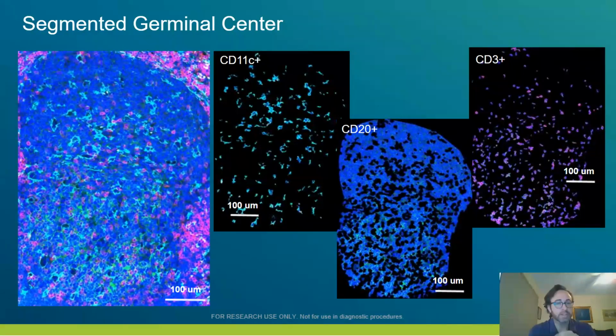The first of these is myeloid cells that are actively presenting antigens and helping T cells understand what they have observed out within the wide world of the body. We're marking these cells with CD11C, and CD11C marks primarily dendritic cells. It may also capture some other myeloid cells that are in different stages of differentiation. The next cell type is the B cell, and again, this is another antigen presenting cell. It's also a memory cell that helps the body understand what long-term pieces of information it's seen in the past.